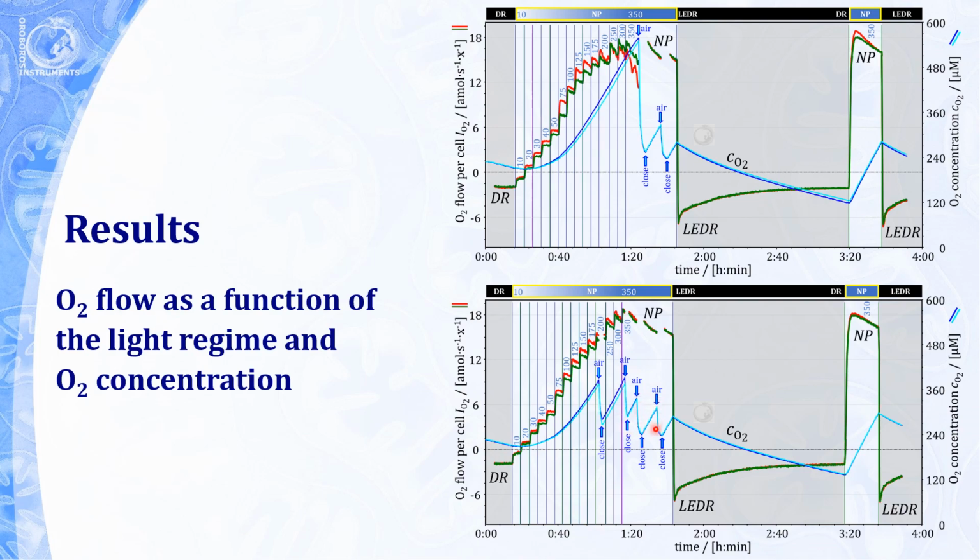The same sample of the equally concentrated cell culture reached different levels of maximum oxygen production at the same light intensity, depending on the predominant oxygen concentration inside each reaction chamber. This indicated that photoinhibition was directly linked to oxygen concentration.